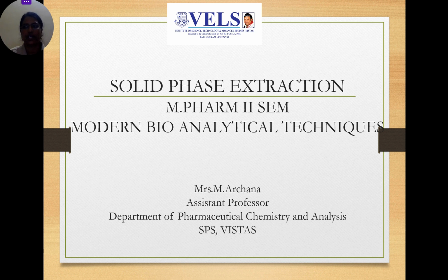So today I am going to discuss solid phase extraction. This is in the subject of modern bioanalytical techniques, which is for the M.Pharm analysis students studying in the second sem. So let's look into the topic.